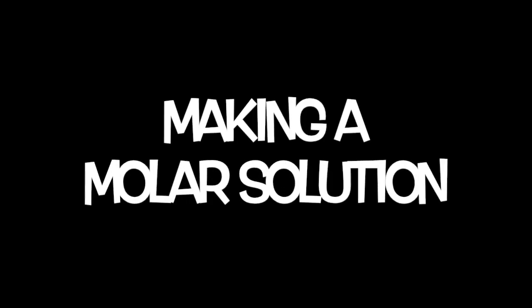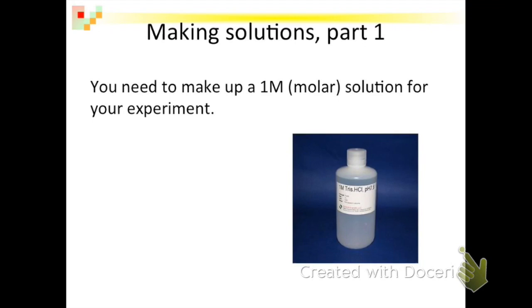Making a molar solution. We're going through today a couple of tutorials about making solutions, and this is part one. We're going to talk about how to make a 1M solution.